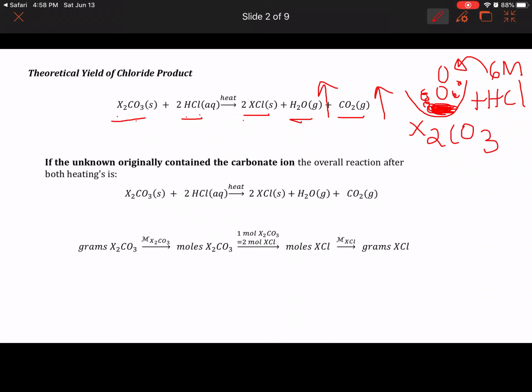By that time it should be soluble, and then you take this back to the Bunsen burner and heat it. But before you heat, you want to make sure that you put the lid, the watch glass, on, and then you gently start heating it, because now you have a liquid here. That liquid can splatter, and you can lose your compound, and if it splatters too much, it can spill everywhere if there is a leakage in the opening. So you want to make sure you control the flame of the Bunsen burner.